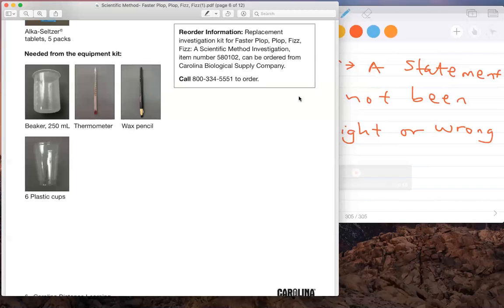Yes, you're going to need that. For those of you who have not read the background, you will need an ice bath. You will need a microwave or electric kettle to boil water to around 60 or 70. All right, Chelsea. You're going to need half.